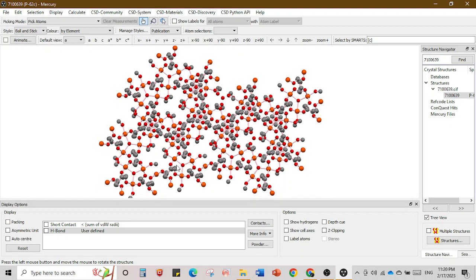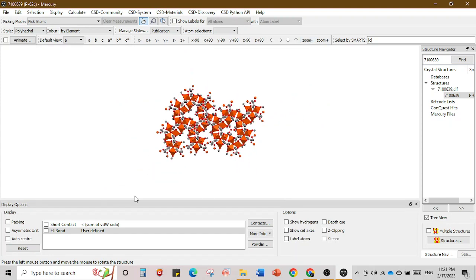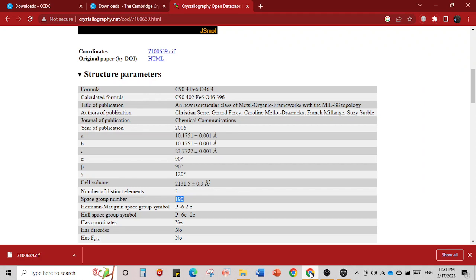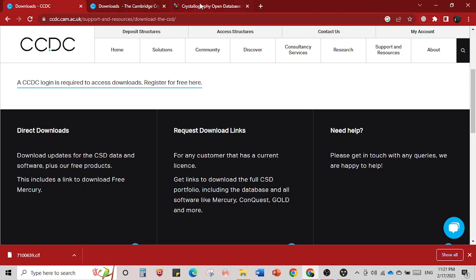You can see the pores clearly. To highlight the metal center pores, switch to the Polyhedra structure — this is beautiful. You can see how the pores go inside. When you build a large number of units this becomes obviously interesting to see how beautiful these structures are.